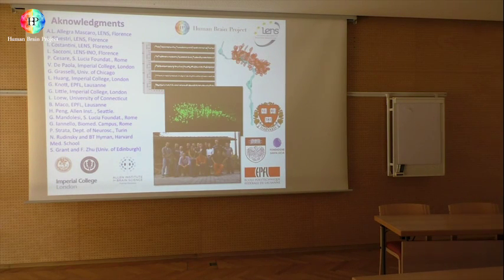So let me close here. I know there are a lot of things, I know that I cannot go deep into details, but let me say that this kind of lecture was just to give you a flavor of what we can do. Of course, I don't want to pretend to talk of all optical imaging because it's much vaster than this, but the take-home message is the following. When you are talking about the brain, always think about the multimodal approach. You always need to connect the single neuron with the whole context.